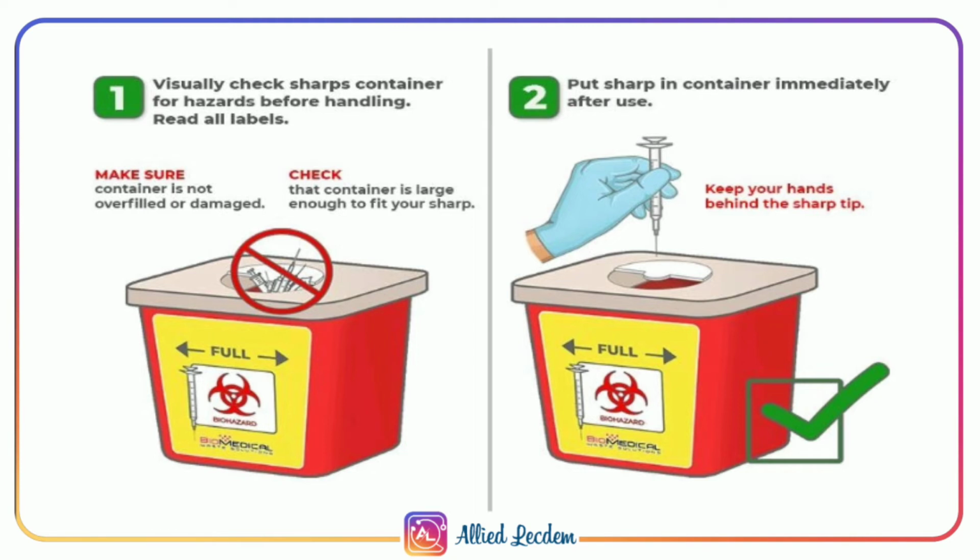First, visually check the sharps container for hazards before handling. Make sure the container is not overfilled or damaged. Check the container is large enough to fit your sharps. Second, put sharps in the container immediately after use.